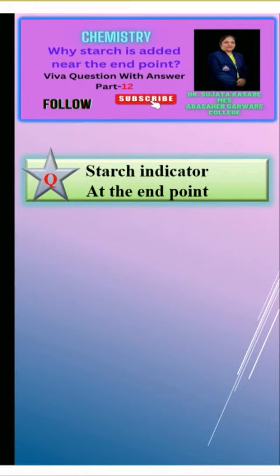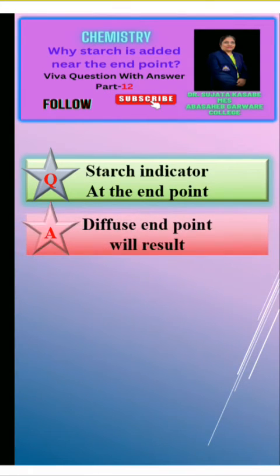There are two reasons. First is, a diffuse end point would result from the slow dissociation of the starch and iodine complex if a large amount of iodine were absorbed in the starch.